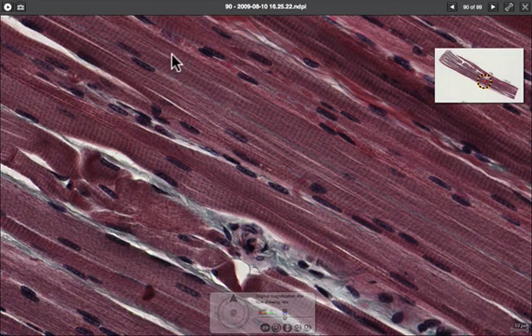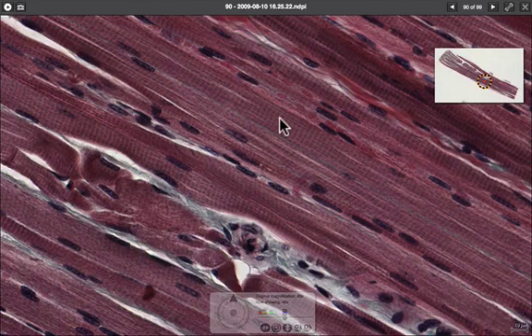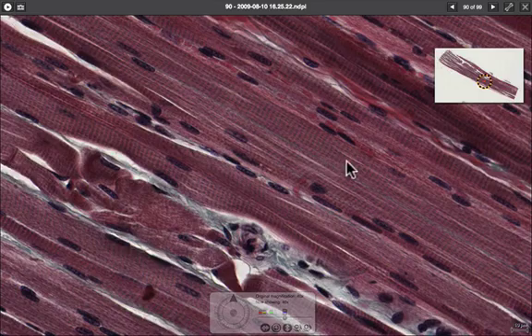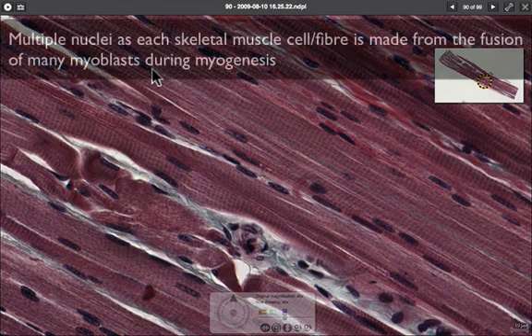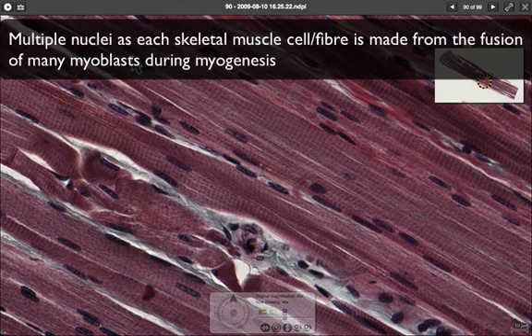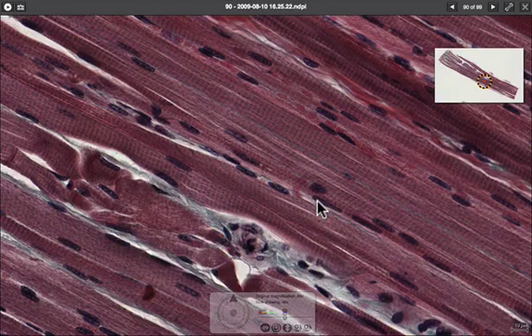Each fiber is represented by this long cell — this is one side of the cell, this is the other. One thing we notice is that the nuclei are peripheral to the cell. There are multiple nuclei in a skeletal muscle cell, located at points all along the muscle fiber, not right within the center.